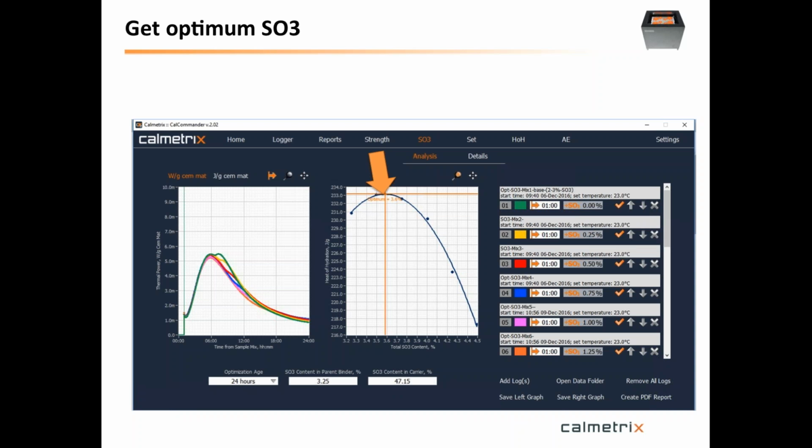Now, of course, we did an optimization that was really only based on compressive strength development. We're not naive. We know from our customers, and because we're from the industry, that there are other criteria that come into play, that you don't balance sulfate just on strength alone. Rheology is a chief criterion that you hear very often, where people say, in my plant, I balance my sulfate, sure, I do the compressive strength testing, but I have to adjust because I need to reach a certain rheology. And if I don't reach that, then my customers are unhappy.